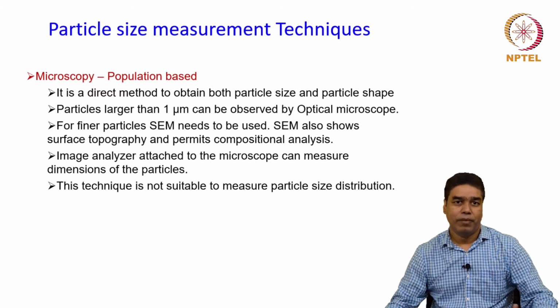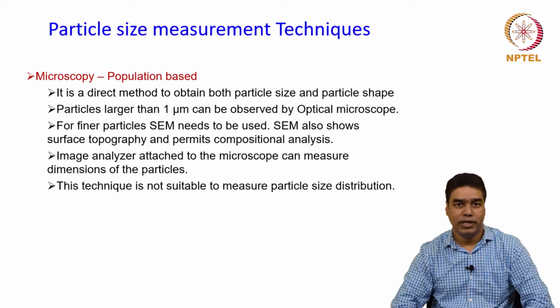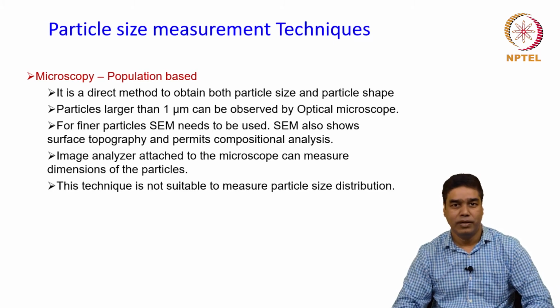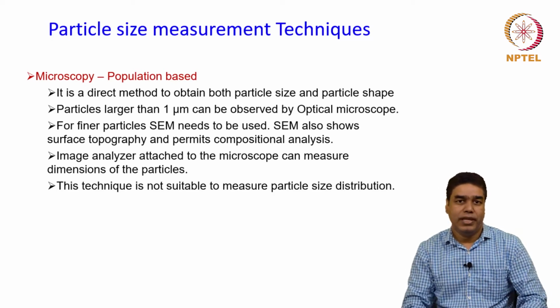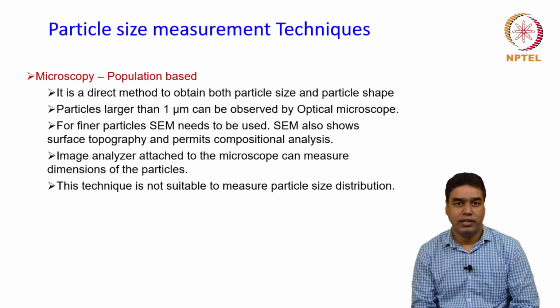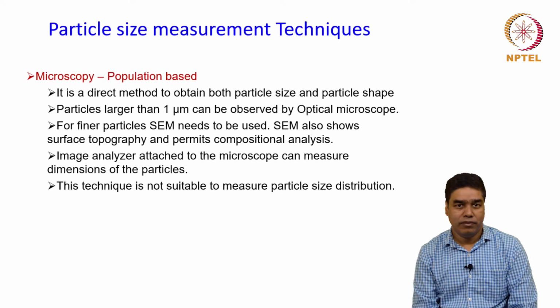Similarly, in the microscopy technique, if you have smaller particles and if they form agglomerates, it will be difficult to distinguish the individual particles and therefore it will be difficult to measure their size. Therefore, the particle size range which can be measured by these techniques is limited. So we need to find alternative techniques which are more capable and can overcome these limitations.